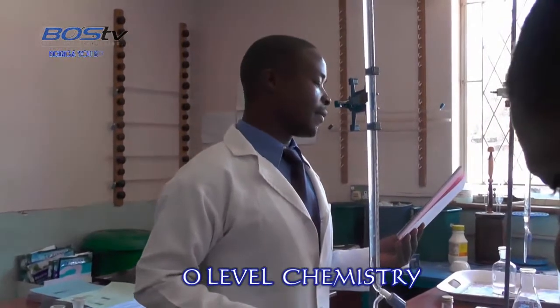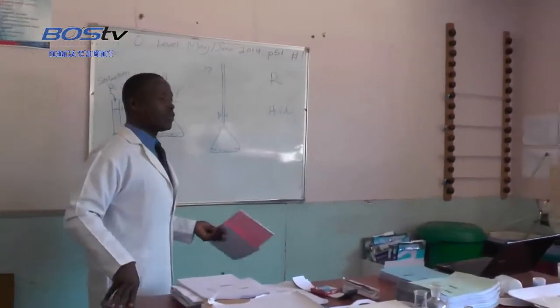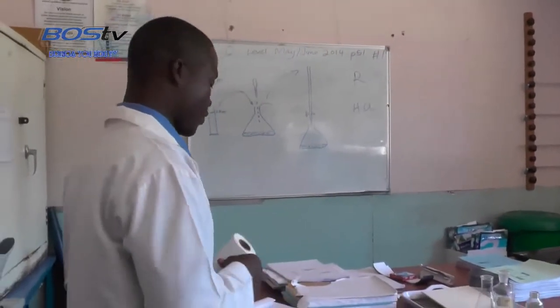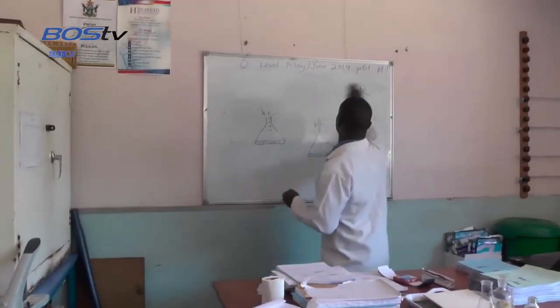What conclusion can you draw from experiment 3? Don't ignore that one since you did not do experiment 3. Then F. Listen, the volume of hydrochloric acid added in experiment 1 reacted with all of substance S and half of substance T. We are told that our solution contains two substances, S and T.